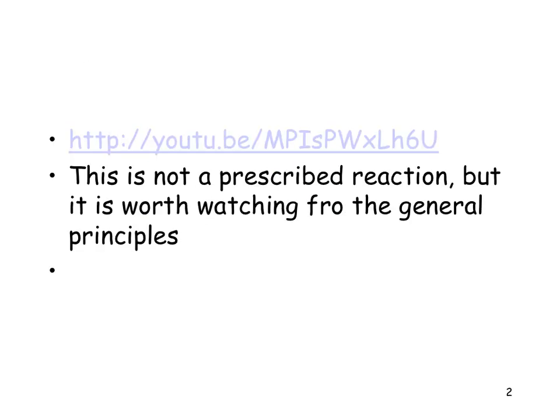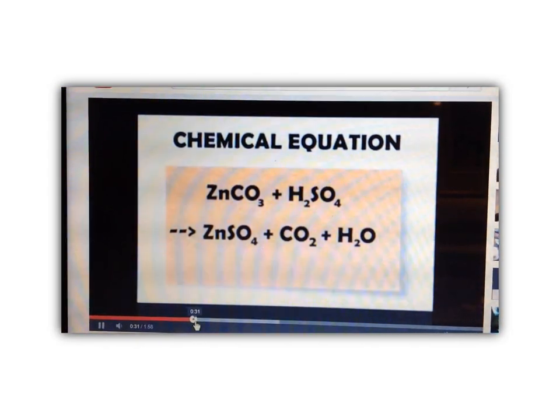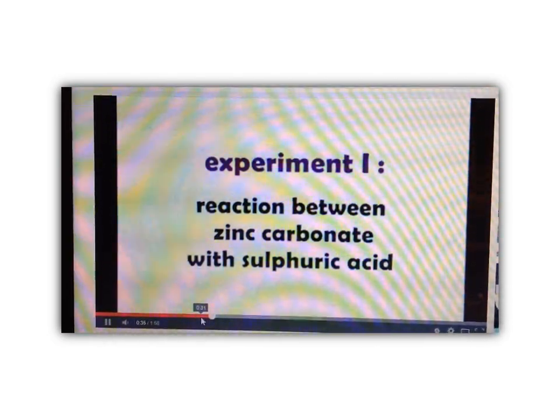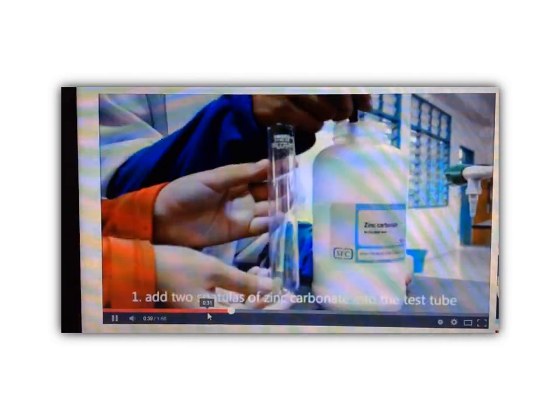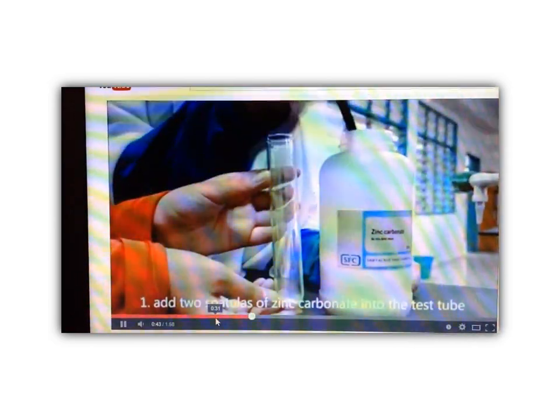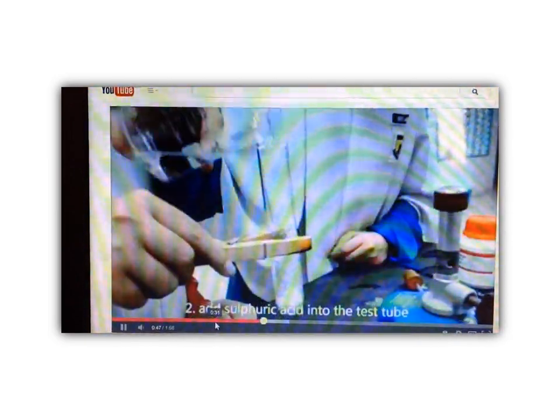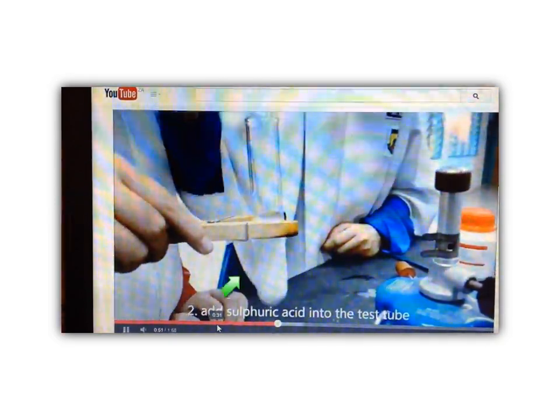This particular reaction that we're going to watch isn't one of the prescribed ones, but it is quite interesting to watch. We're going to have the reaction between zinc carbonate and sulfuric acid. I'm going to add some zinc carbonate into the reaction vessel. It's a white powder. Put some sulfuric acid onto that. It immediately starts bubbling like crazy.